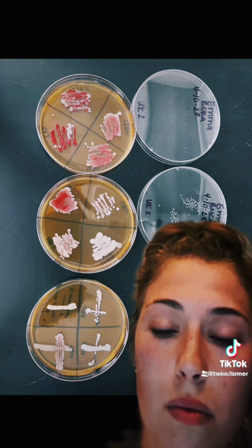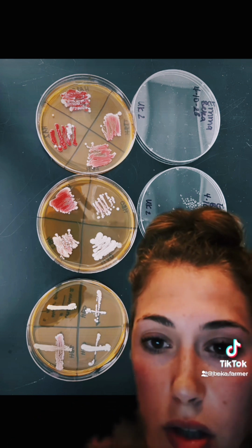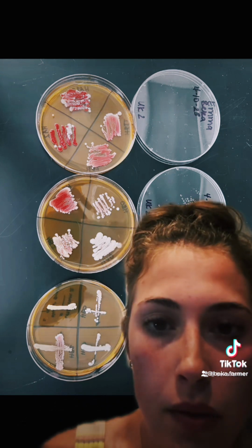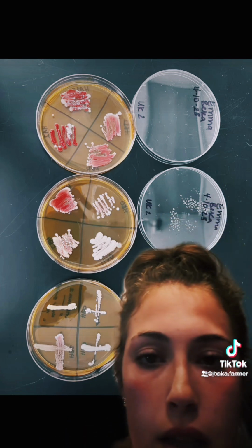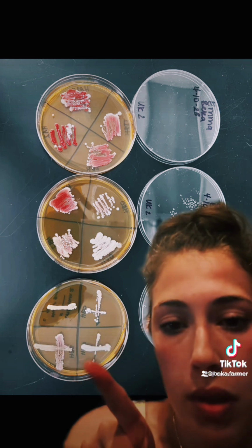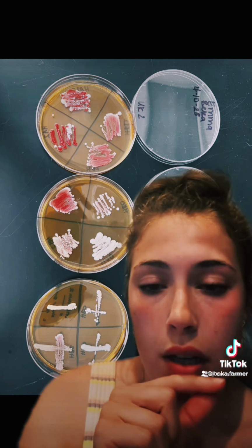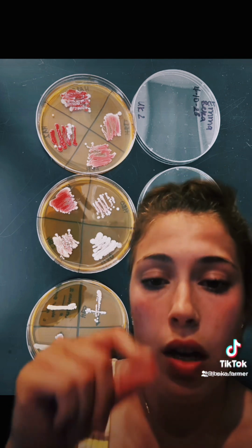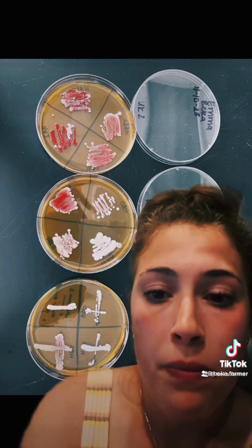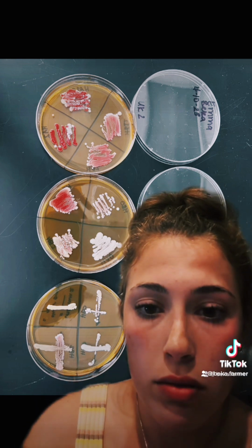So I went ahead and re-isolated those 3 strains and was able to distinguish HB2 as having the accumulation of red. And then going back to the plates, the proper way to culture this in this experiment would be this 3rd plate here, which is the one that I did. So you take your unknown strain and go one way, and then you cross that with your known strain, the HB2, HBO, HBA, and then through that you'll be able to see the proper results.